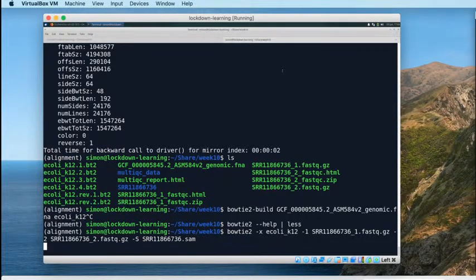If you've got 40 threads, you can run 40 of those alignment problems simultaneously, and in theory you can solve the whole problem 40 times faster. It doesn't actually work out as 40 times faster because of various bits of overhead. But that's the idea behind running multiple threads for a program like Bowtie2: you can take advantage of having multiple CPU cores available on your machine to parallelize a particular job.